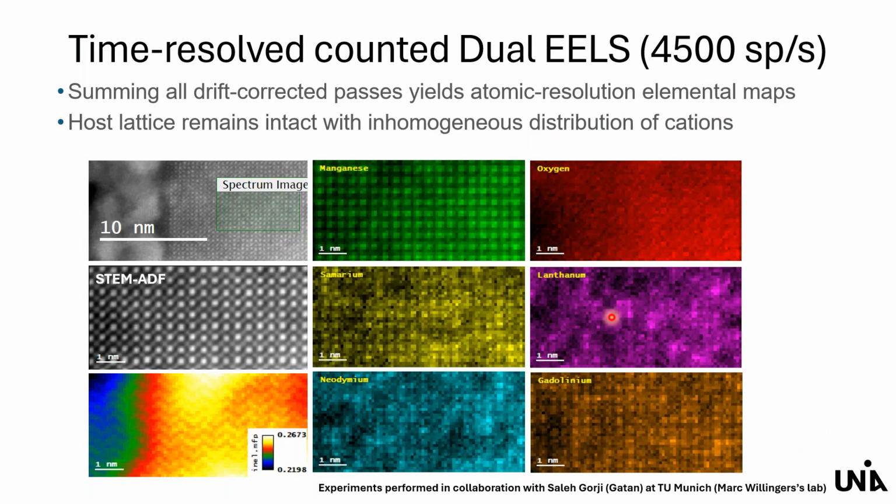So the questions keep coming in. Maybe I will end with this question because of time, and then we'll answer the rest over email. It says, it looks like you extracted the white lines for the atomic EELS plotting instead of using the quantification in GMS, which avoids using an energy window region. Is that correct? What if some elements have no white lines, for example, just a flat edge jump? Do you want to answer?